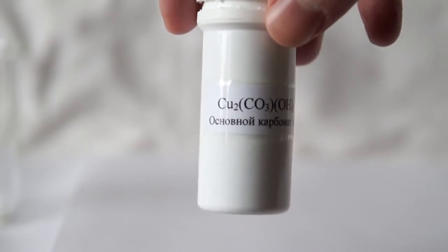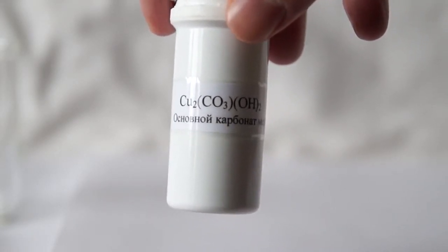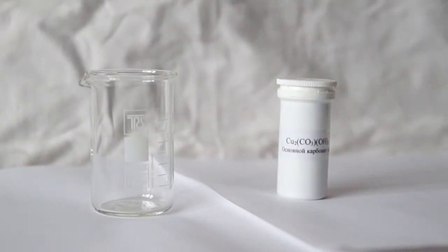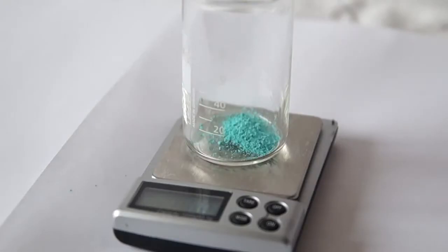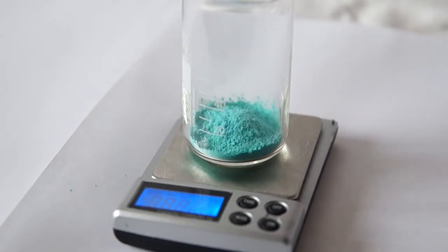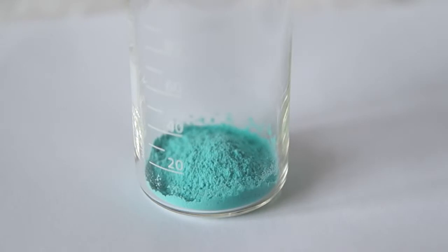We will need basic copper carbonate for this experiment. The substance is formed by copper sulfate and baking soda reacting with each other. Take a beaker and pour in about 4 grams of basic copper carbonate. Copper carbonate has a greenish tint.